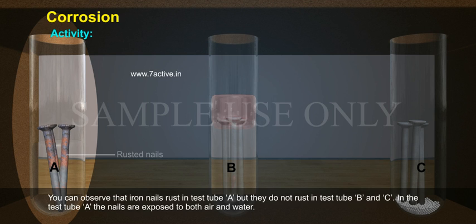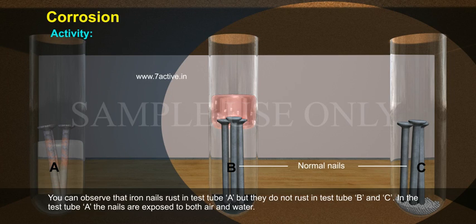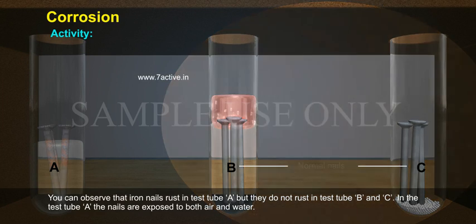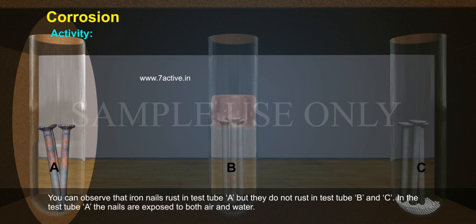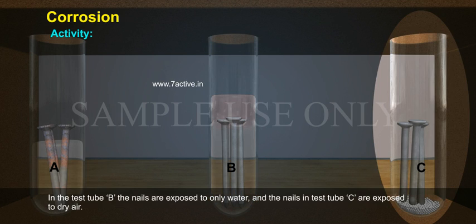You can observe that iron nails rust in test tube A but do not rust in test tubes B and C. In test tube A, the nails are exposed to both air and water. In test tube B, the nails are exposed to only water, and the nails in test tube C are exposed to dry air.